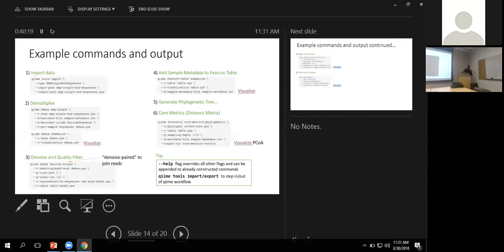So one way you can help to visualize that is to color these by a metadata category. So for instance, we can set the color by body site. So now we can see that we definitely have gut samples clustering together and separate from, you know, the palm and tongue samples. This study took samples over time.